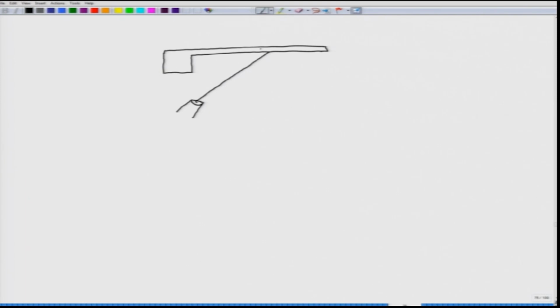Oh, by the way, this is our week 8 lecture 3, W8L3. You shine a laser on this cantilever, and the laser will bounce back like this. So, this is how you are shining, it hits that silicon cantilever and it bounces back.